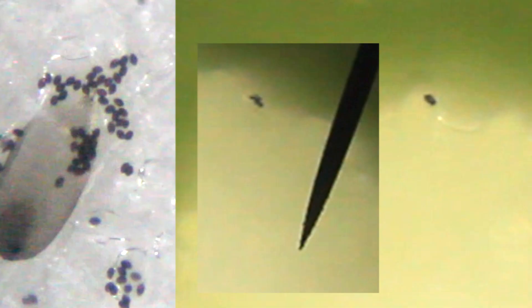I've done my best to train my eye to be able to see the spores on butterfly scales pretty effectively and quickly over the last seven years. And this hasn't been by looking at pictures on the internet — this has been by looking at actual samples, the real thing. But even so, I don't think it's good enough to just say I've trained my eyes real good, believe me. Instead, let me show you what I've been looking at. Here is a positive OE test from a monarch, at the same magnification as the egg which I claim has OE spores on it. There's OE spores from a positive OE test on the left, and on the right you've got the egg that has definitely something on it. OE spores, while slightly variable, are still mostly consistently the same size and shape — not too much variety. And quite often, OE spores will pair, group, clump, or cluster together. They're kind of sticky, even to themselves. At the same magnification, we can see that this is true of both the OE spores on the scales and the dark specks on the egg.